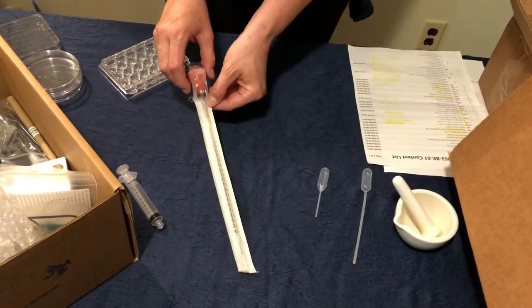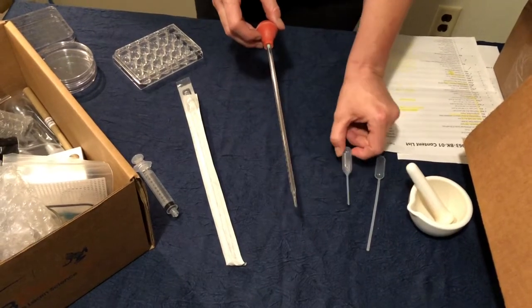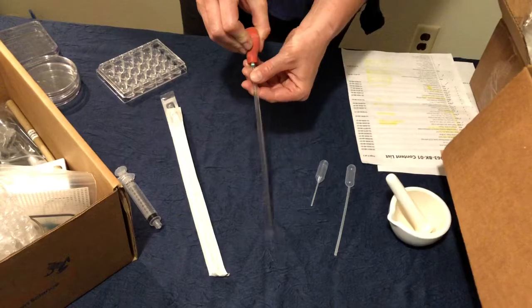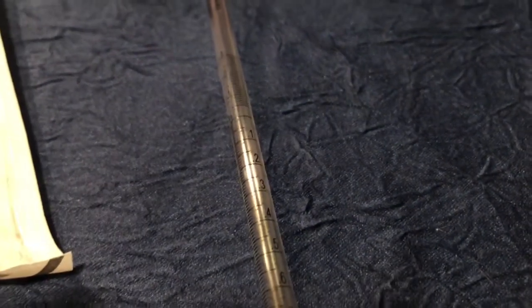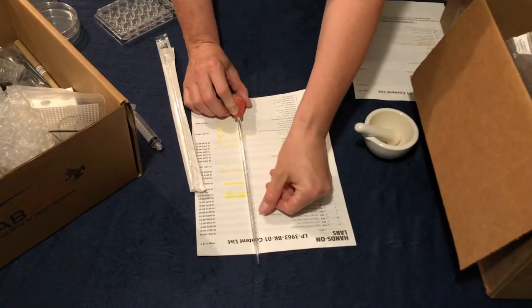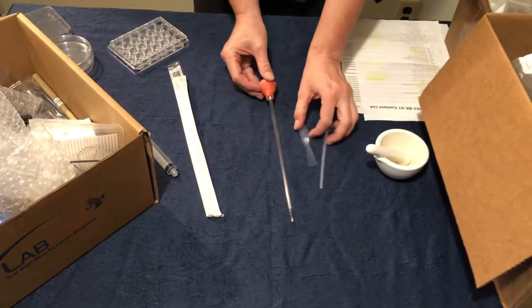Next we have our serological pipette. It's two pieces that come together: a long thin piece and a rubber ball. It works very similarly to the other pipettes — this bulb acts like the bulb on the small pipettes. Squeeze out to push air out, then release to suck liquid up into the tool. The reason we use this is because we have a much finer gradation in our measurements. The total amount of liquid the serological pipette can hold is two milliliters, so we can get down to very minute, very accurate measurements.